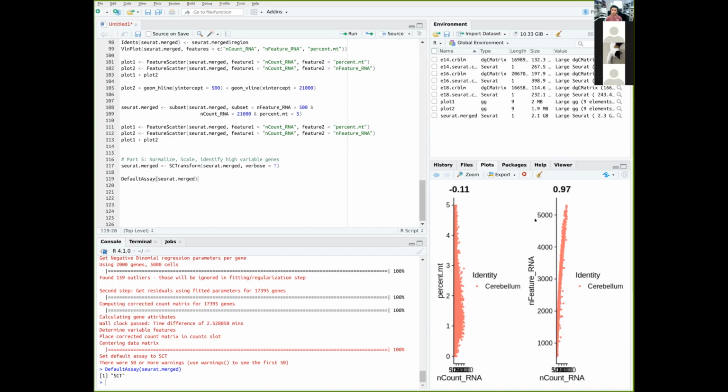So we will now perform the next part, which is dimensional reduction. I like this part a lot, mainly because it looks very pretty. You plot out a very pretty scatter plot. We're going to start with the linear dimensional reduction. And the difference is that there are different models that you can actually use to reduce the dimension. What does it mean by reduced dimension?